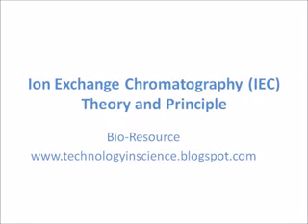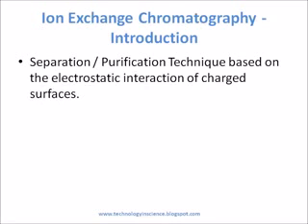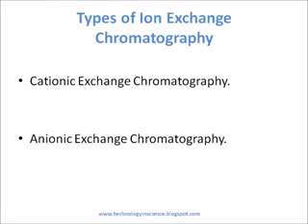Ion exchange chromatography, theory and principle. Ion exchange chromatography is a separation technique based on the electrostatic interaction of charged surfaces. Types of ion exchange chromatography.